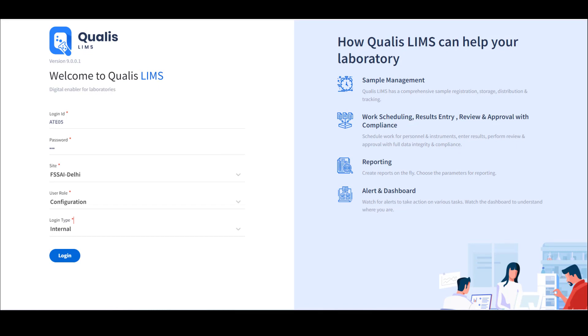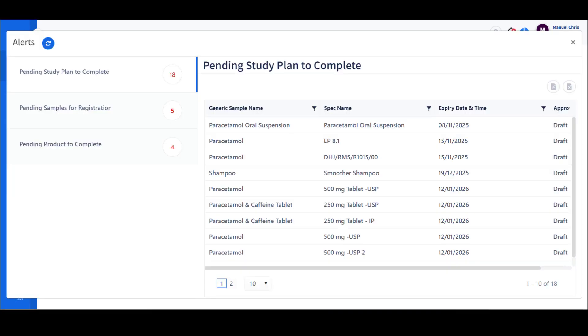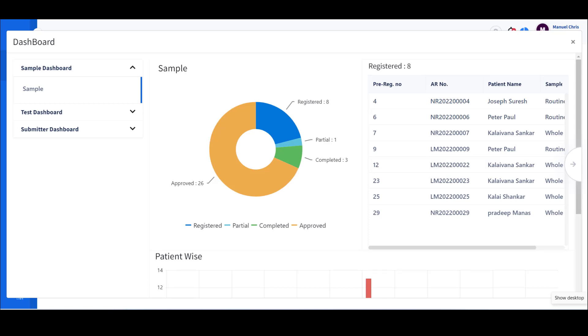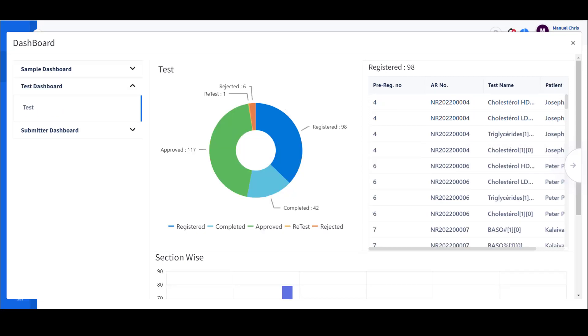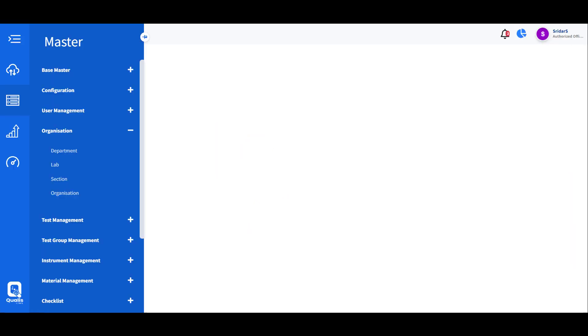Once logged in to Call SLIMS, users can access alerts to quickly review pending activities for the logged-in user. Users can also access the dashboard, which is configurable based on the role. Each role can have specific dashboard elements to view activities happening inside the laboratory, such as section-based workload, sample overview, and sample turnaround.